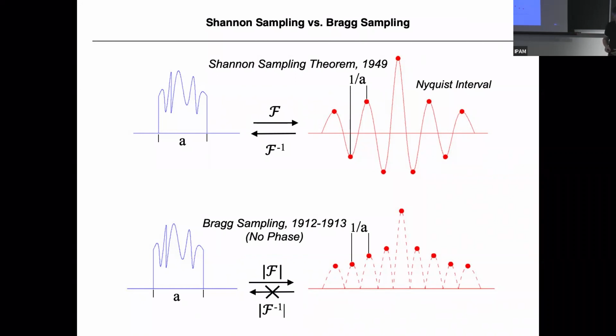Sorry, I'm confused. Can you say again what this Shannon sampling theorem is? So Shannon sampling is about a signal, a function of time t. You have a signal, let's say you type an email. Then you digitize this signal. The signal is digitized, but you digitize it in reciprocal space. All the signal propagates, so you just need to sample those points of the Fourier transform.